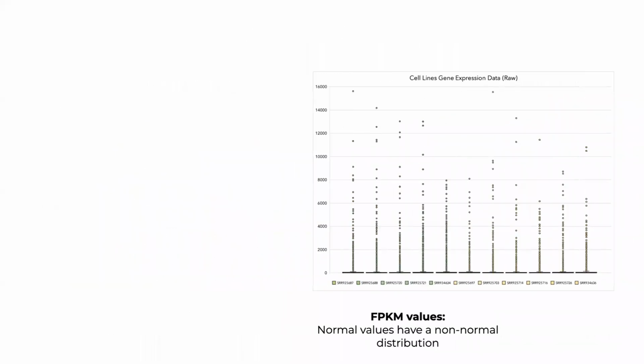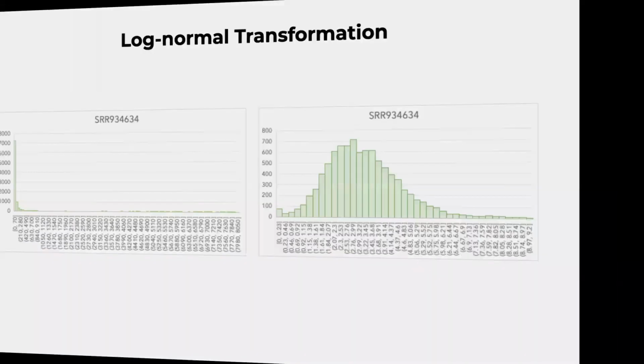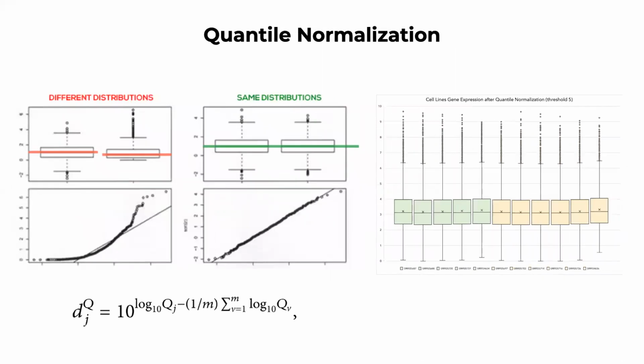Okay, so one of the ways that we can study this data is by also looking at the histogram. The histogram can be useful for us to do what's called quantile normalization. Quantile normalization is the ability to make those samples comparable. Why do we need to make them comparable? As we look at the gene expression table, we want to understand how these individual samples represent a condition.